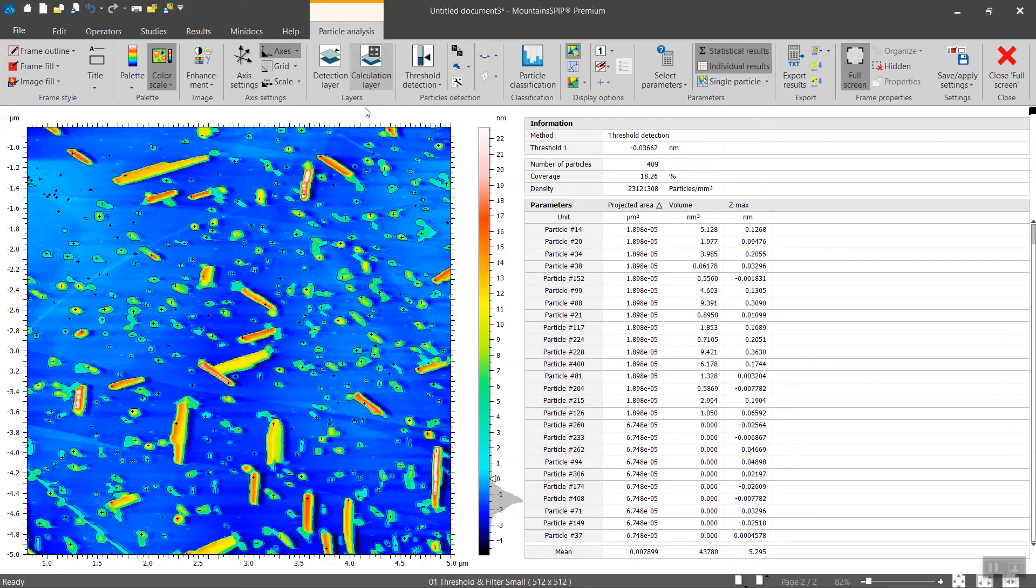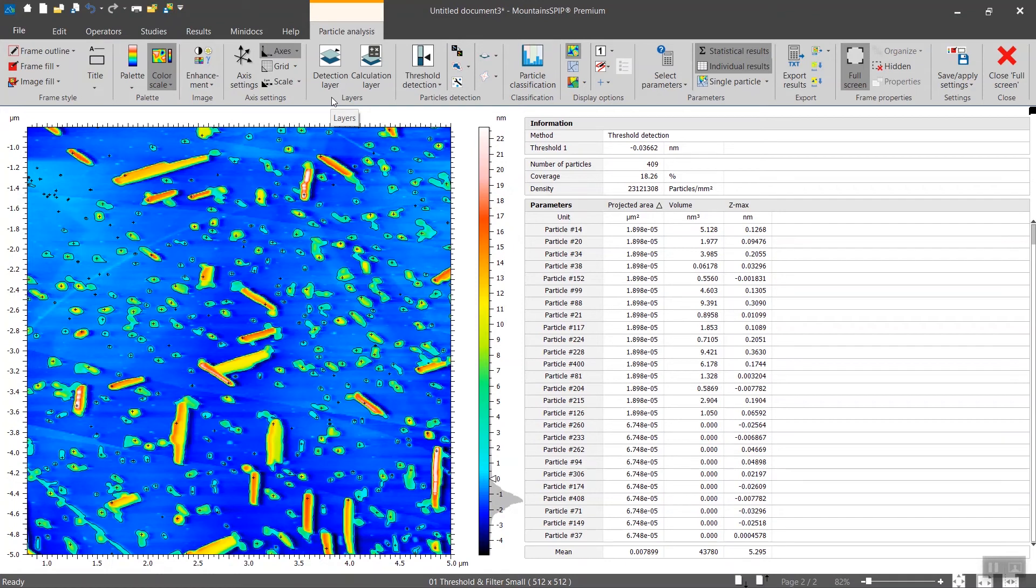There's a section here called layers. We will show you later that you can detect features based not only on the topography but on all of the channels available on your data.